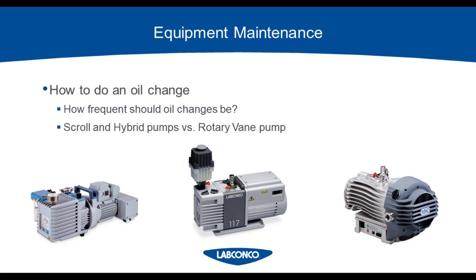If you are using a hybrid pump or a rotary vane pump, oil changes are very important and must be done. A scroll pump is an oil-free pump, however, that will also require some maintenance. To do an oil change, just follow the manufacturer's recommendation on how to do an oil change and make sure you're using the correct oil for your pump. A hybrid pump will take a synthetic oil.